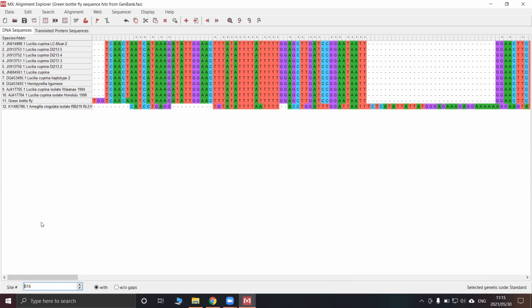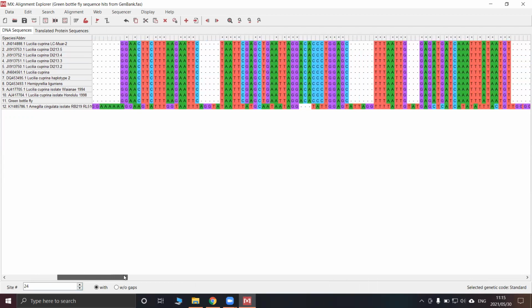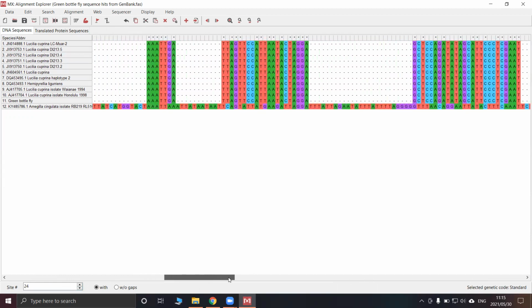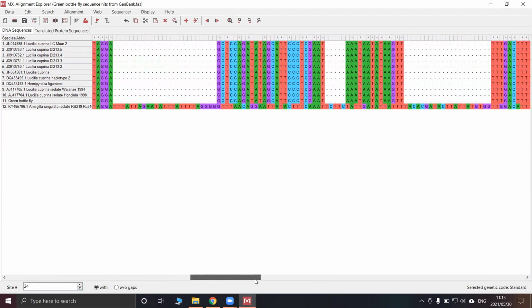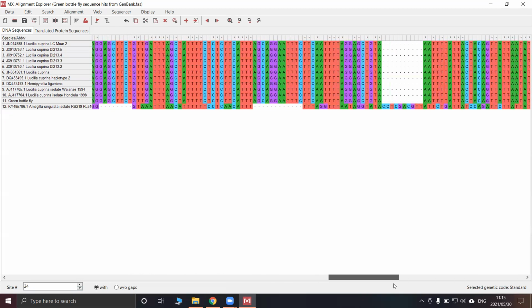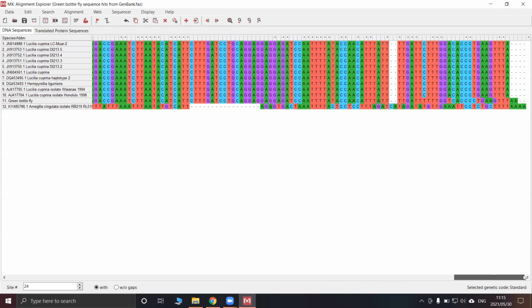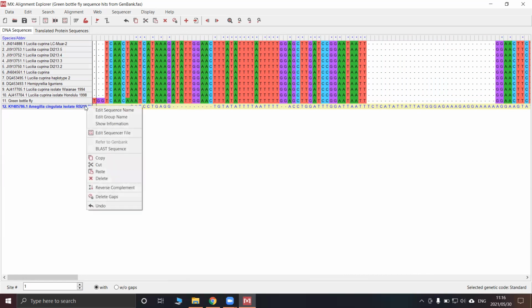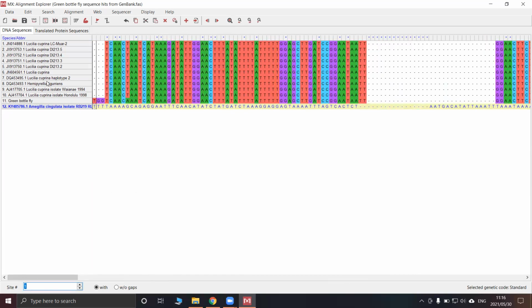So as you can see, our root does not match up identically with many regions of our GenBank hits and our sequence, but the sequence that we have queried matches up lovely with the hits that we got. If you see something like this where your root breaks up, it is normal. However, if you think that this sequence could have been submitted in the reverse direction, as a check we could reverse complement the root.